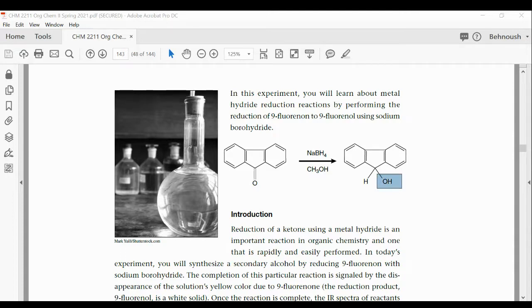But if you use 0.4 grams instead of 0.49 grams, then you would get a lower theoretical yield. I think you did not multiply by density. I can check your specific. I got 62.16% yield. Yes, because you did not multiply by the density of the methyl benzoate.